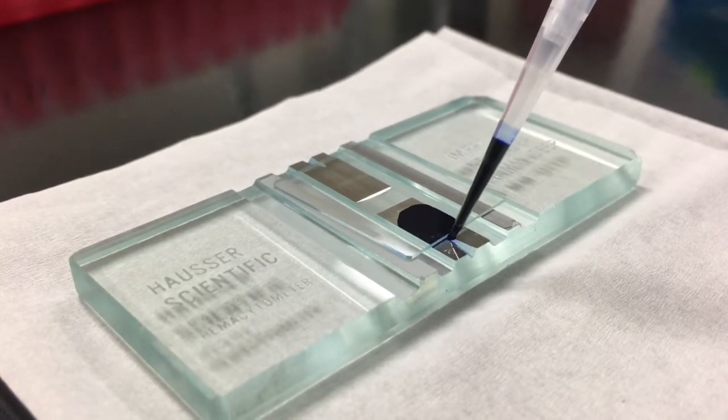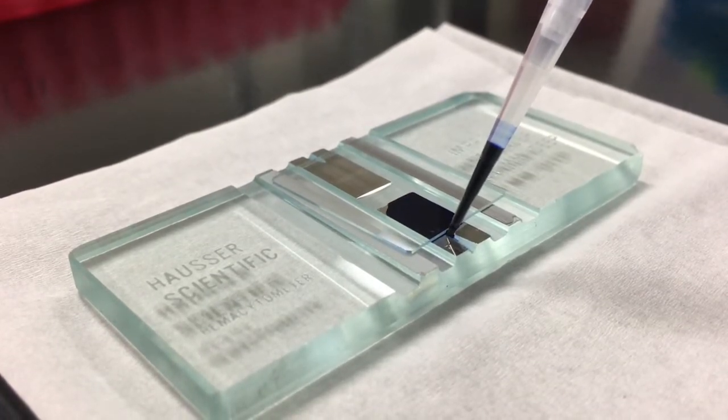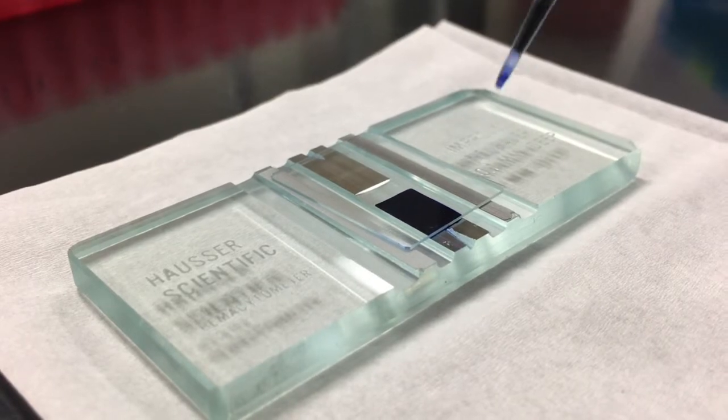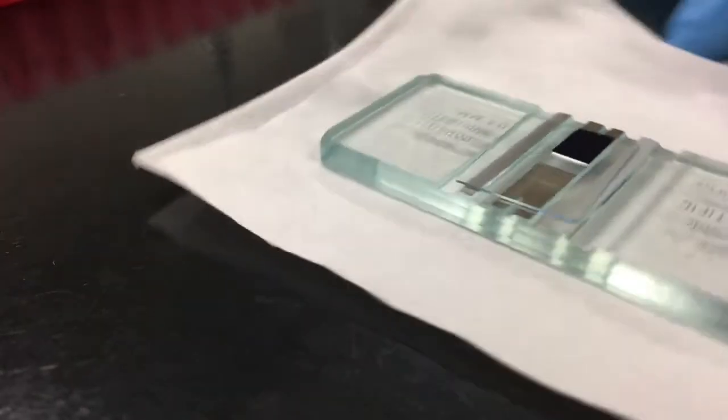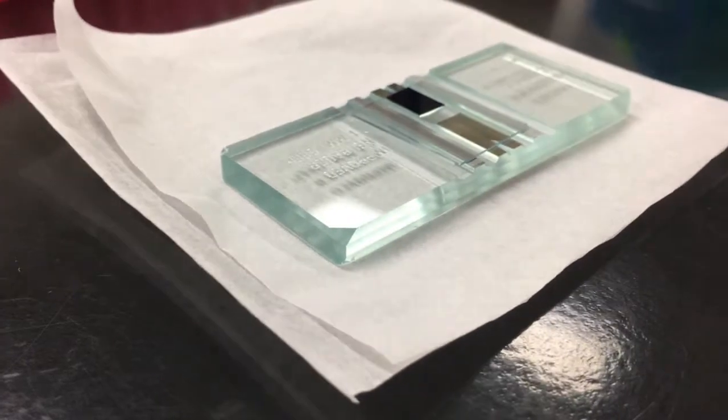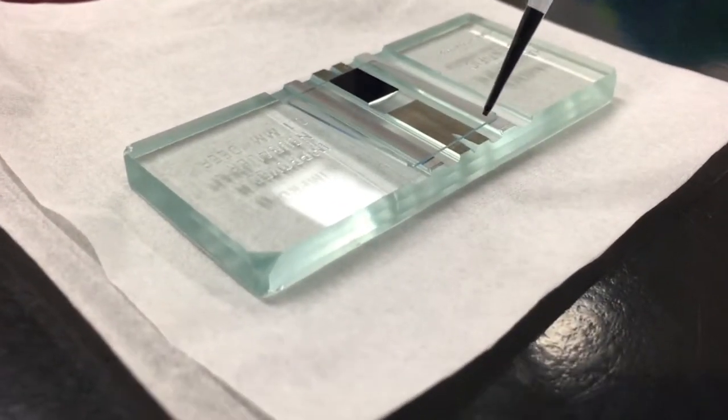Depress the plunger slowly and allow the suspension to be drawn under the cover slip until it completely fills the chamber. Stop filling once the fluid reaches the edges of the chamber and appear as sharp straight lines. If the edges appear wavy you have overfilled the chamber and need to start over.